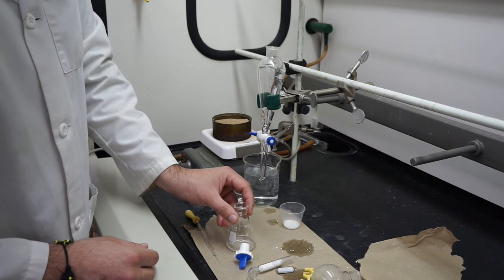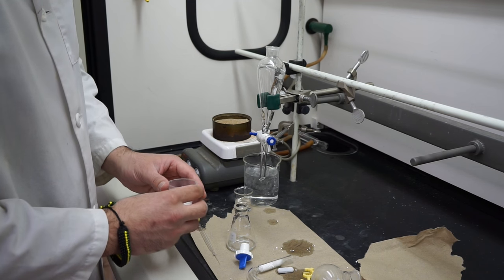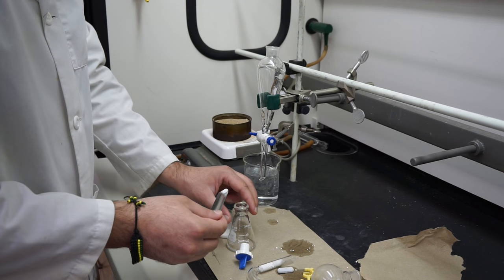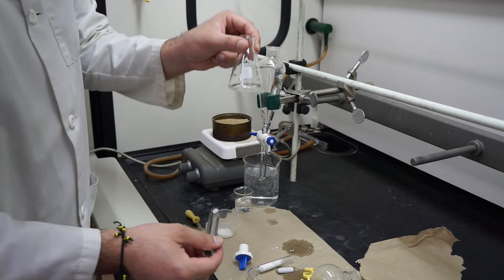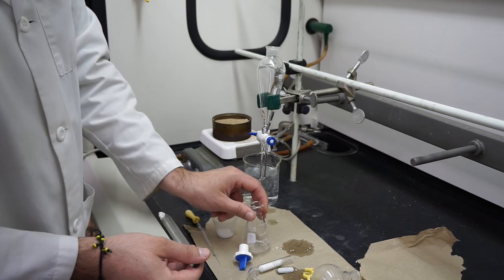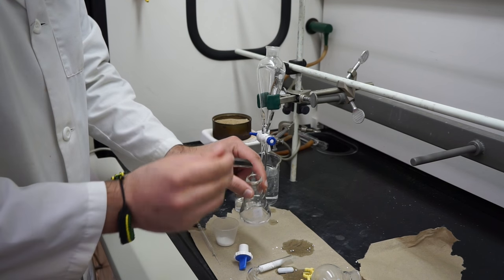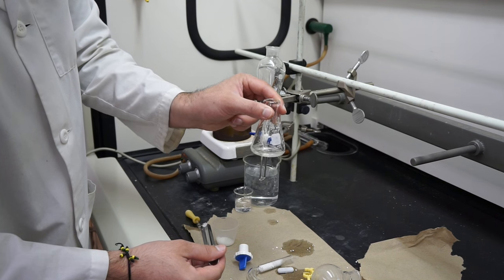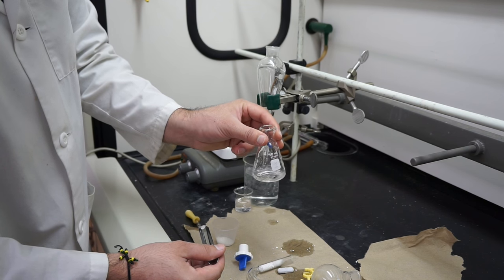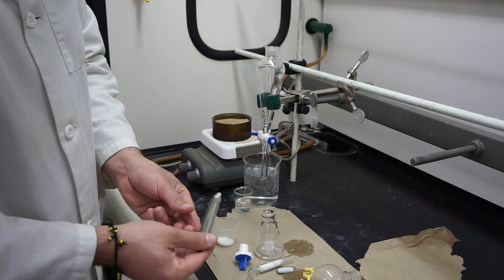Once you have the organic phase fully collected, you're going to want to dry it — meaning remove all remaining water. Take a little bit of potassium carbonate and add it into your solution until your solution turns clear. You may have to add a few scoopfuls, or some of you may only need half a scoop. Just add it until the solution turns clear and you don't see any more murkiness in your solution. That would be a good stopping point for this experiment.